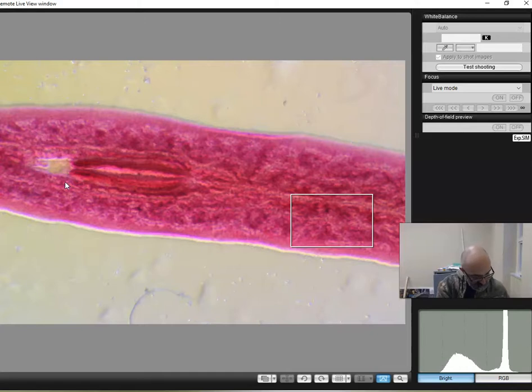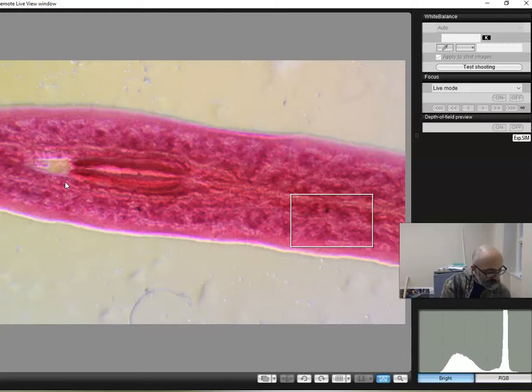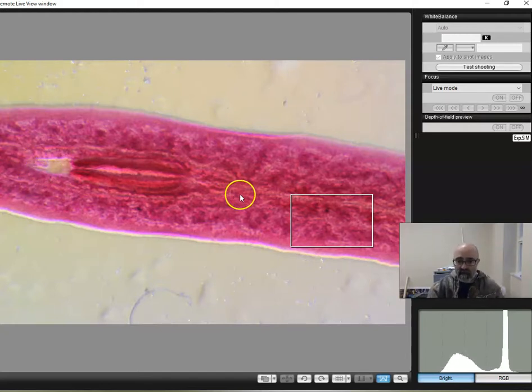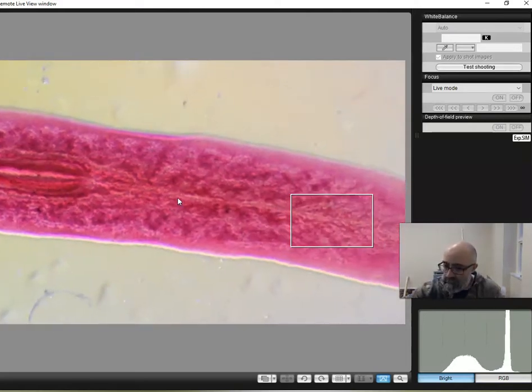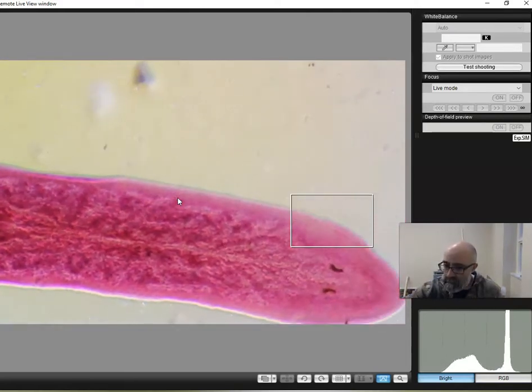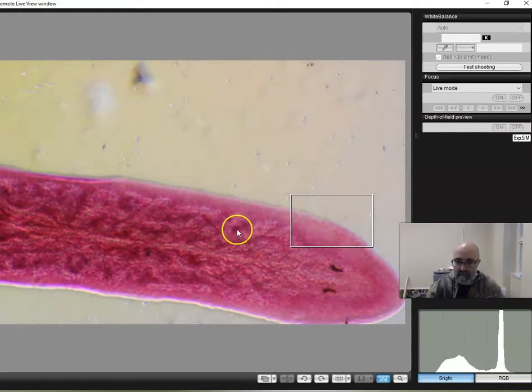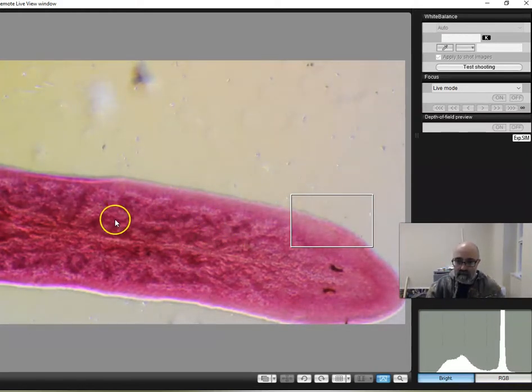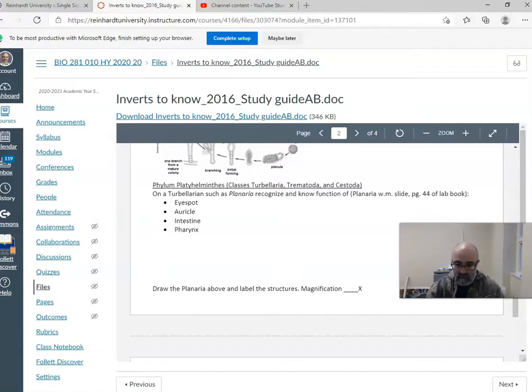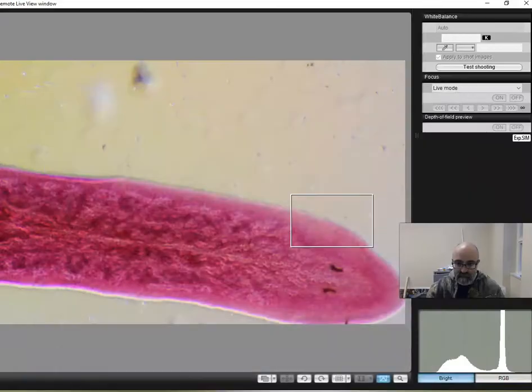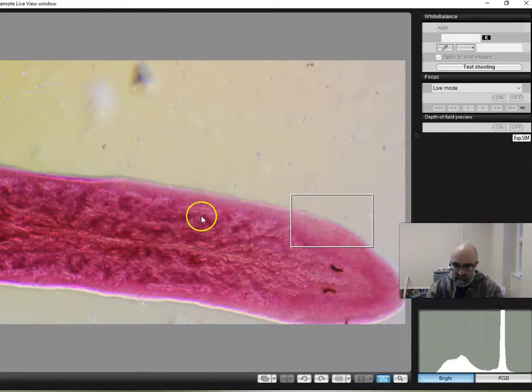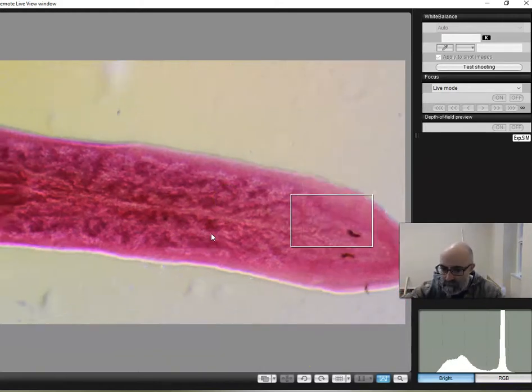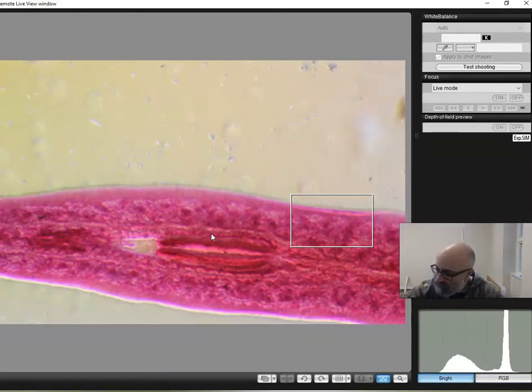So this is the out. The intestines really are all of this dark colored tissue here. That is the intestine. And that's it. Okay. So that's the free living planaria. Eye spots, auricles, intestine, pharynx.